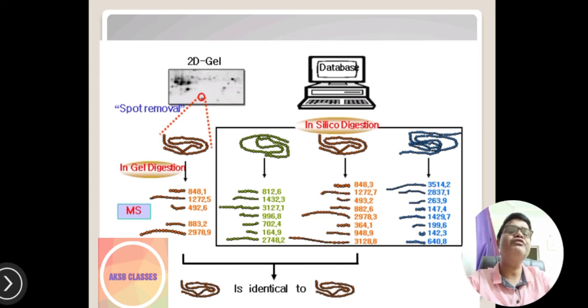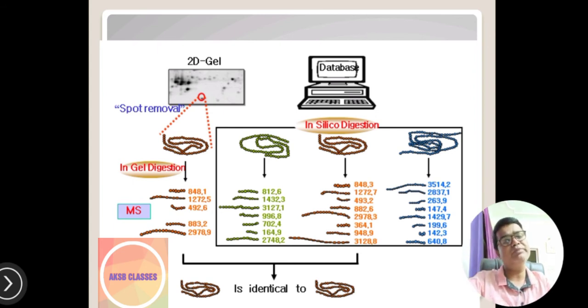With the help of this MALDI-TOF, with the help of a reference sample and software for comparing with that unknown protein sample, we will be able to know the amino acid pattern: whether hydrophobic or hydrophilic amino acids are there, where the basic amino acids are in the unknown polypeptide chain, or whether acidic amino acids are there. We try to find whether there is a presence of aromatic amino acids. With that reference sample we match the percentage matching of the unknown protein's amino acids, and then we find out the helical structure as well as the molecular weight of the protein.